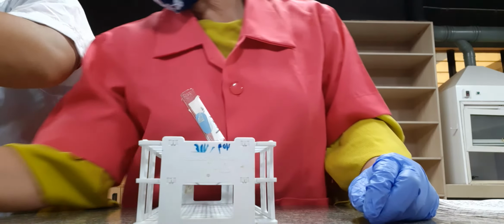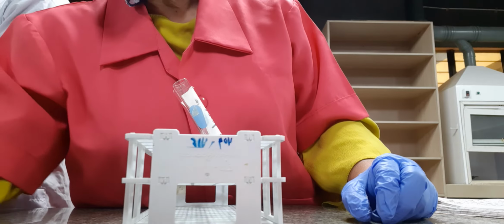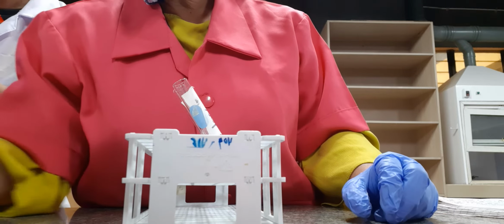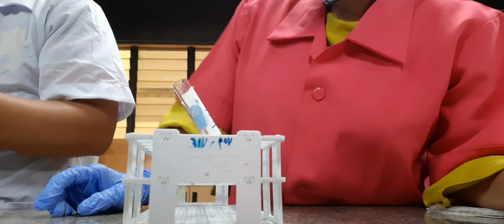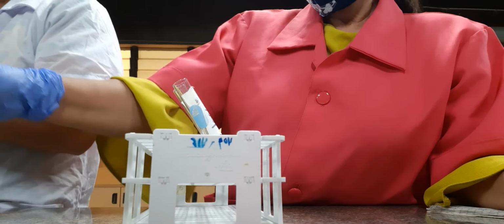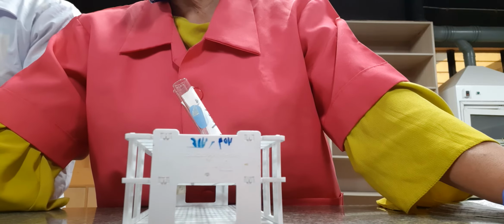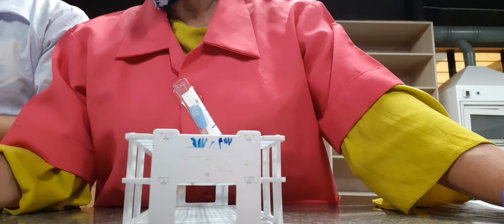Acetaldehyde, acetone, benzaldehyde. No more acetophenone. Ethanol.